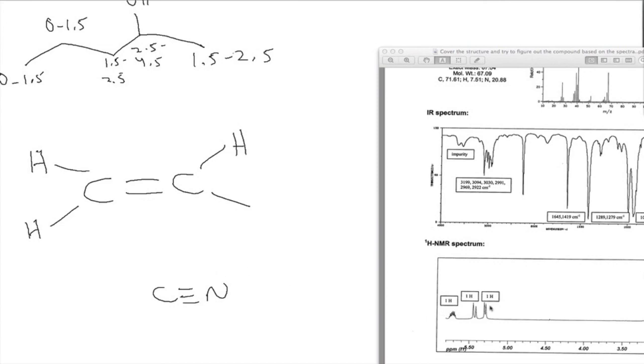Sure. If you take a look at this spectrum, would you agree with me that this is an alkene hydrogen? Because it's in the 4.5 to 6 region. Oh, so just all of those hydrogens in that region. And there's 3 of them, yeah. You know it because of the region. So how many hydrogens are in the 4.5 to 6 region? 3. That's why it's obvious.